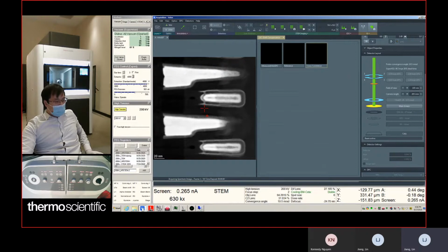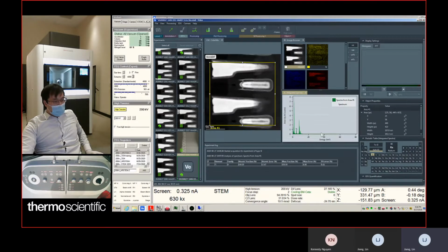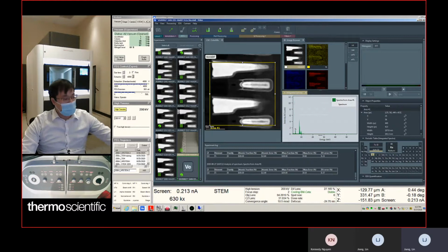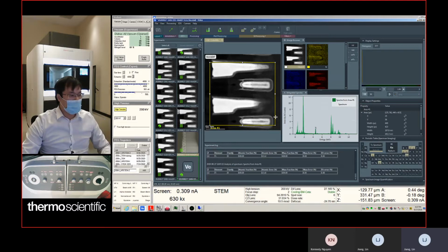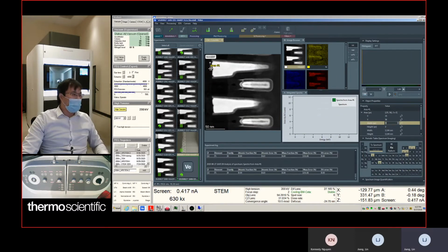In this case, because we are interested in identifying this layer, you see we get more energy range, but the resolution may be getting lower, and the peak to background ratio, the cross section, may be getting worse. Let's select this 3 by 3. They will move to the region of interest.